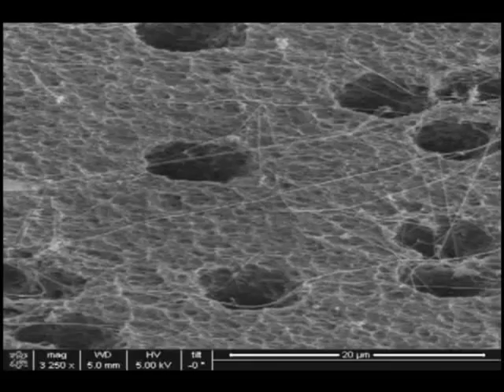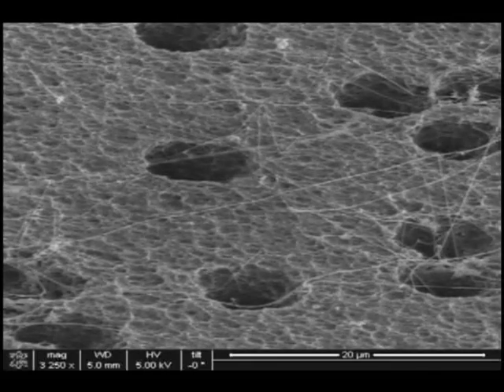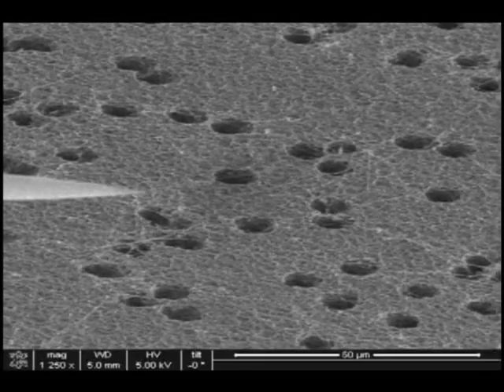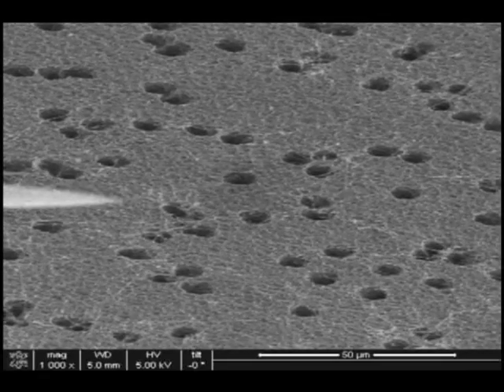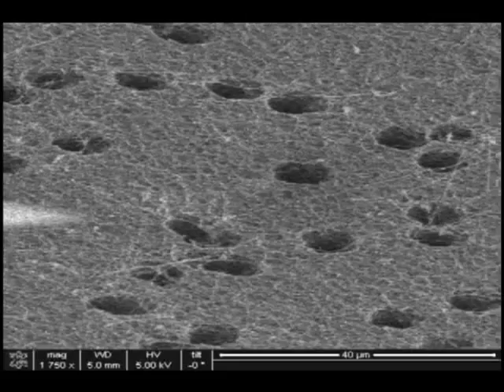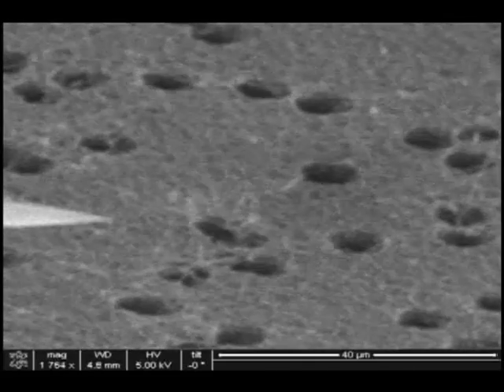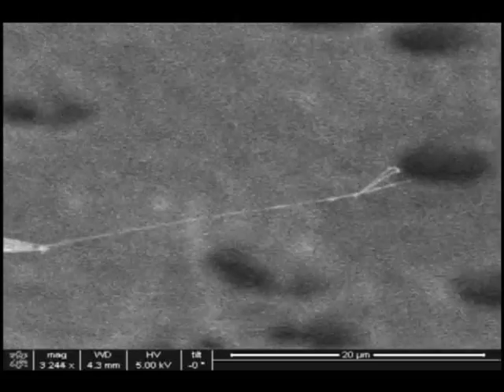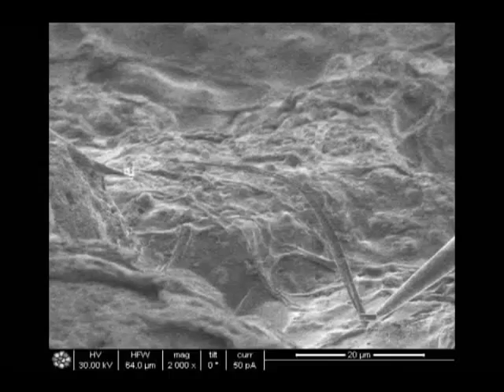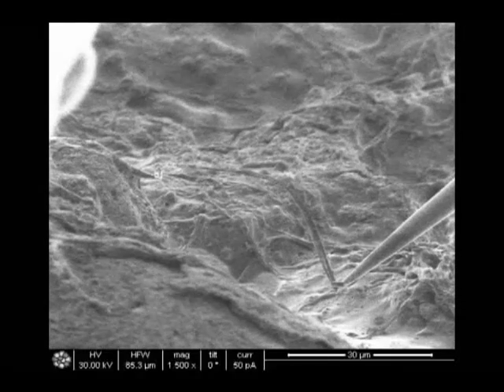Here, precise directional and velocity control allows coaxial alignment of the manipulator tip to a nano wire, which is a critical requirement for the desired analysis. E-beam deposition attaches the wire, which is then gently pulled along the x-axis at controlled velocities to detach the wire from the substrate, followed by a z-axis movement of the manipulator away from the substrate to completely isolate the wire.